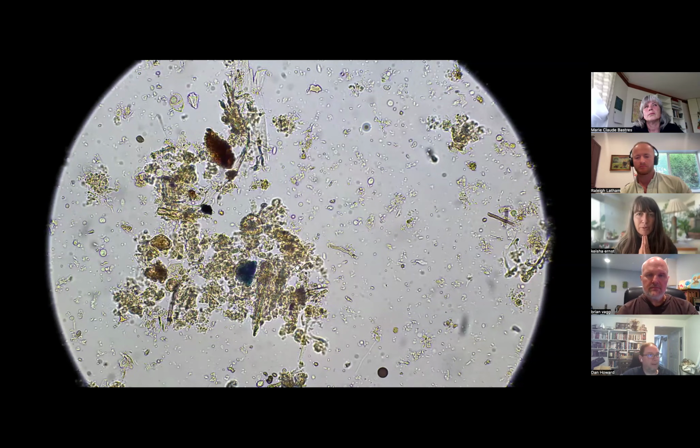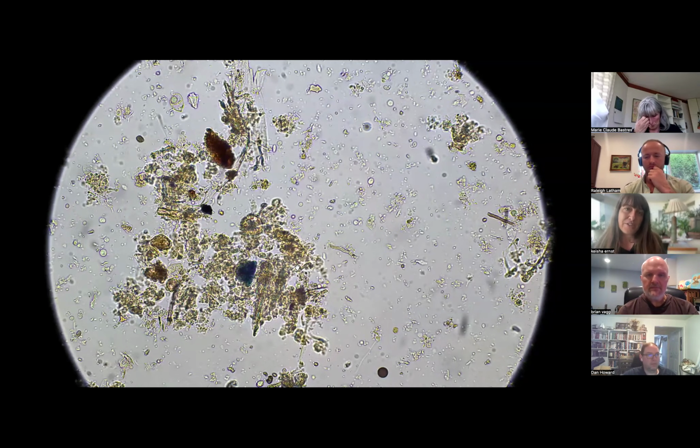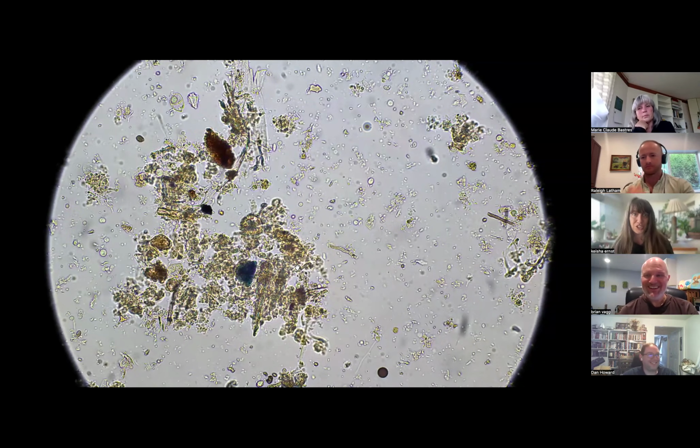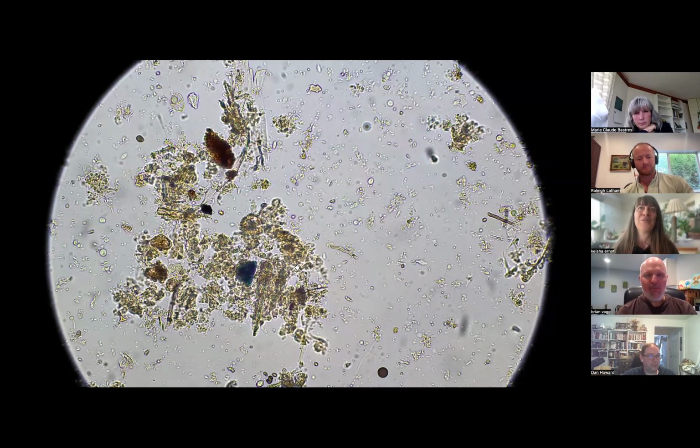You could liken it to what we're doing here. When Brian just threw that sample on, we were like, wow, that's great. Look at all these nematodes. You don't necessarily need to say that there's 60 per sample to say that there is an abundant amount of nematodes. He's doing just fine on nematodes, lots of fungi. So that's one tool that we're going to have.